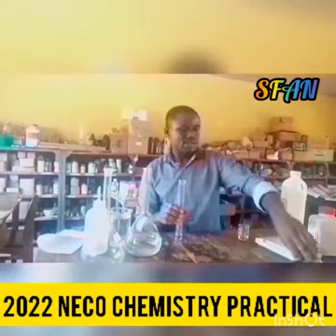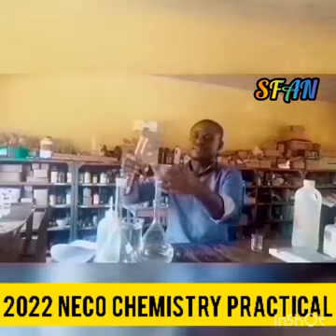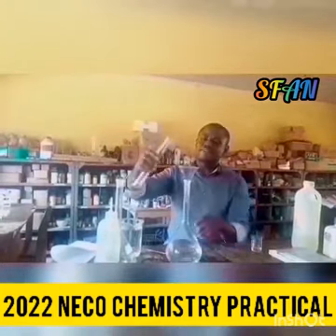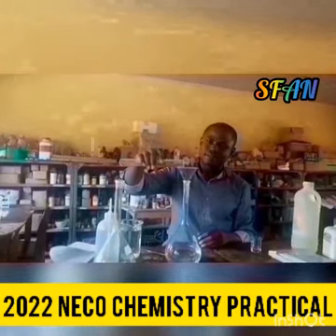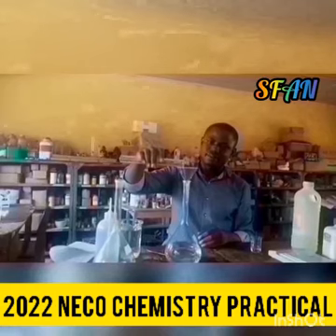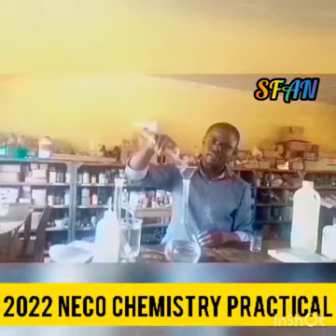So I'll transfer the 9.5 cm³ of the acid into the volumetric flask.